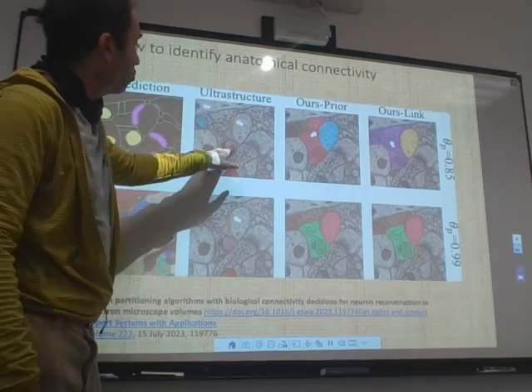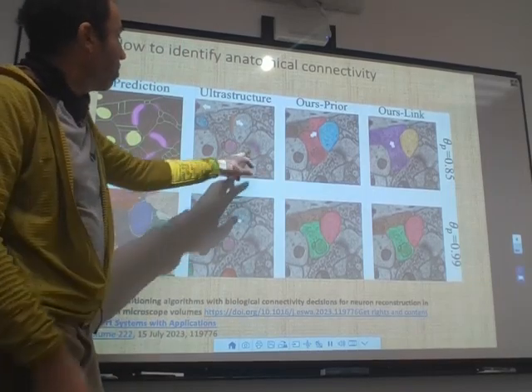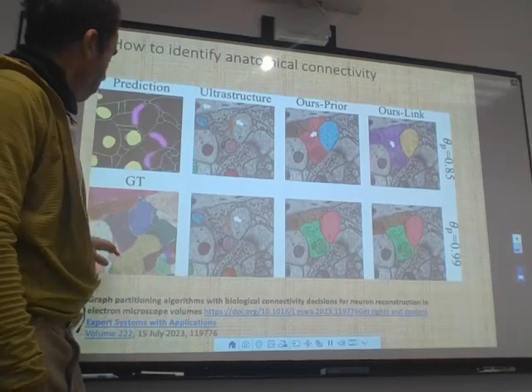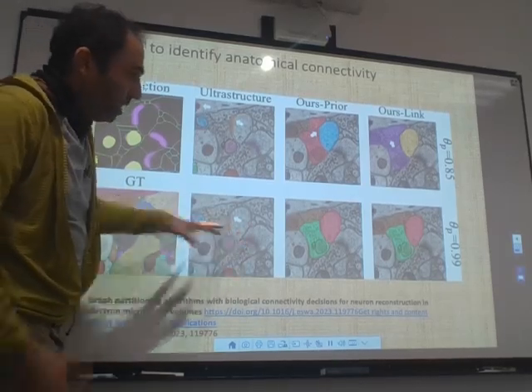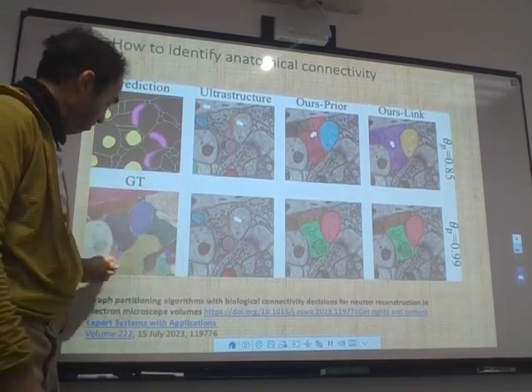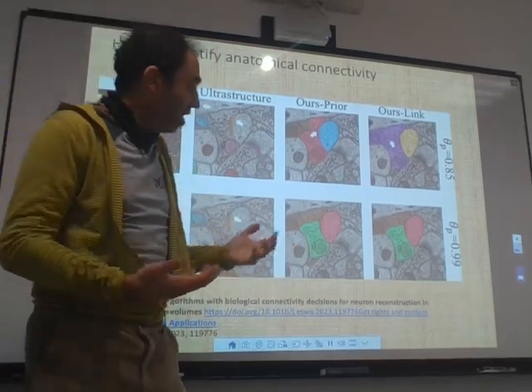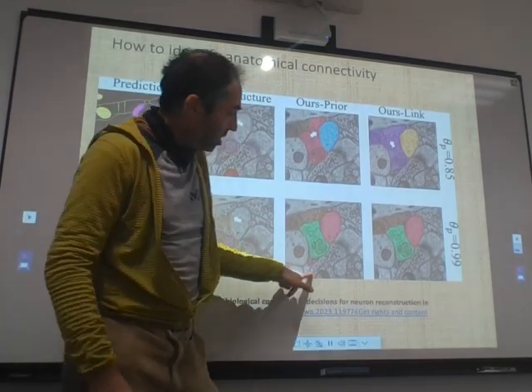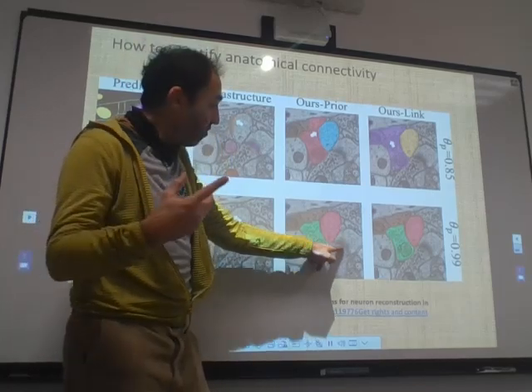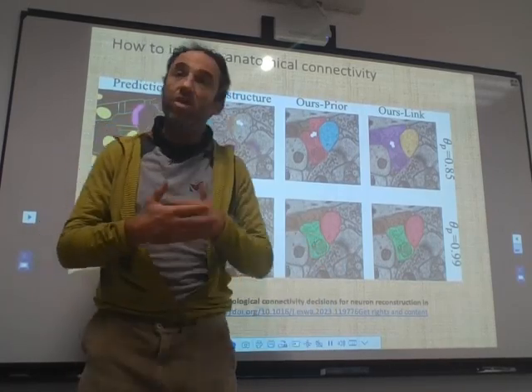You want to identify those structures, which are called mitochondria here. So you want to see where, for example, they are. You want to quantify here those vesicles. And in the end, you want to have some label that identifies basically each cell. So you put a label on each piece that you have here, and even you can go beyond, as I said to you, because if you want to recognize a synapse, you see here the vesicles are not necessarily close enough. Although they are forming a cluster, they might not be close enough to the surface.